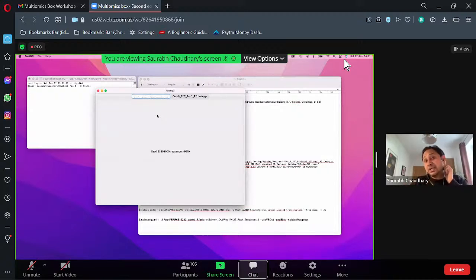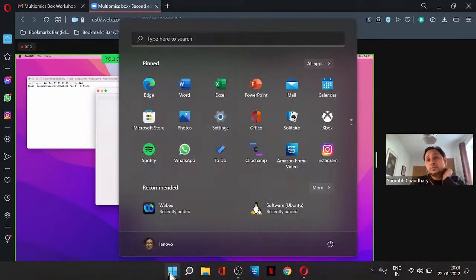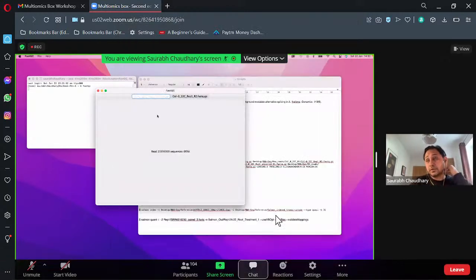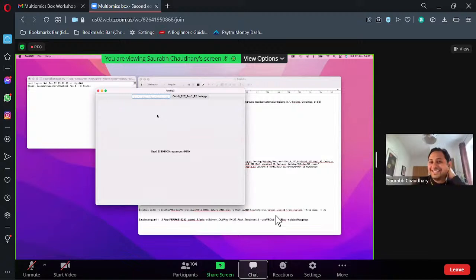In Bowtie, you can't get those splicing details. So HISAT2 is equally good as STAR. It depends on which tool you are comfortable with. Thank you, sir. When you say it is big data, how big a genome are you referring to? Anything bigger than Arabidopsis. Arabidopsis is 135 megabases.